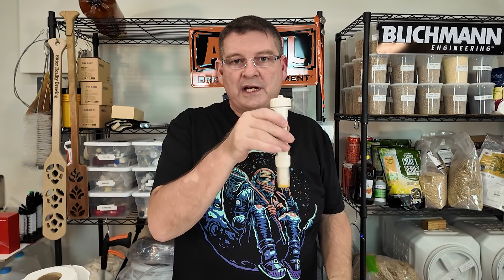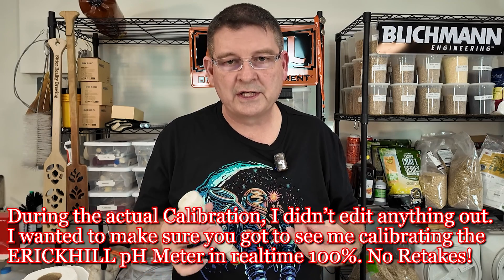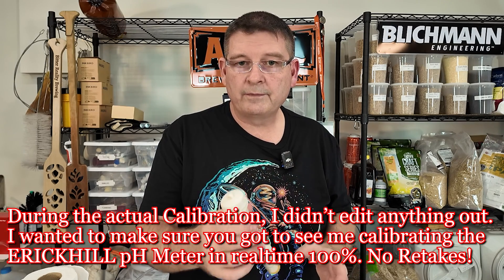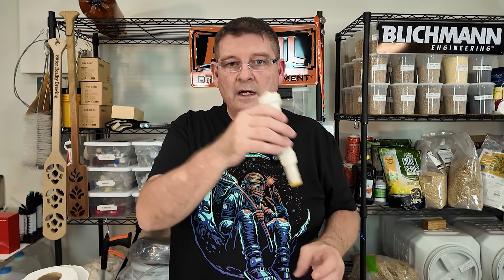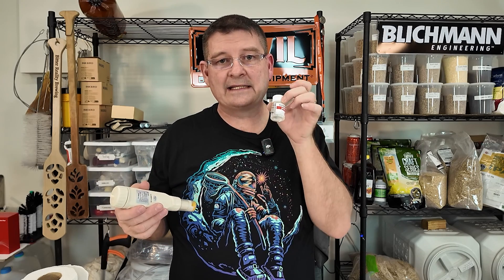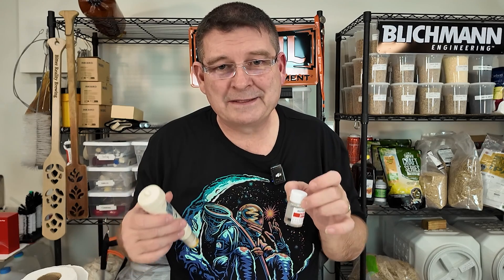You want at least two cups of distilled water, and you're thinking, why? You're gonna rinse this off each time and you want to rinse it with enough volume that you're not worried about adjusting the pH too much from the residue. So each time you do one — the 4.0, which is going to be starting calibration — then you're gonna rinse it off really good. Then you go into your 6.86, and you rinse it off. And then your 9.18. Each of the solutions will take anywhere from about 30 seconds, sometimes to over a minute to calibrate. It's super simple, but you do need to be patient.